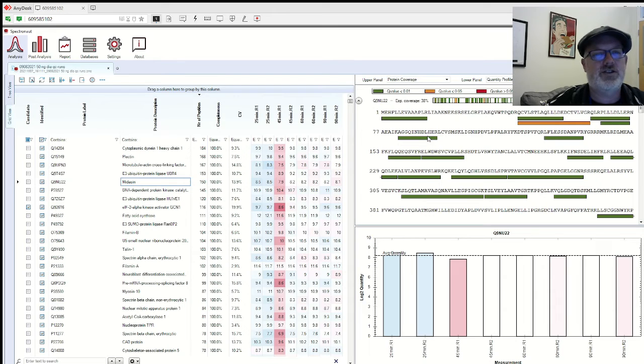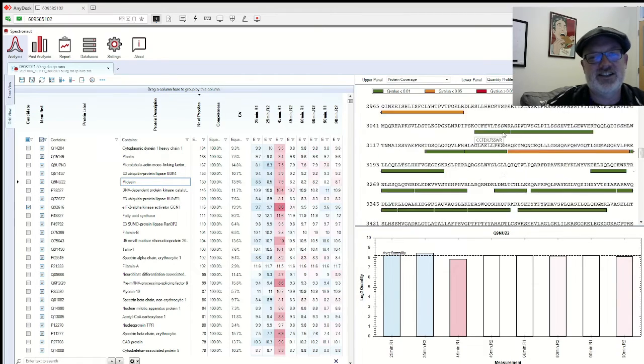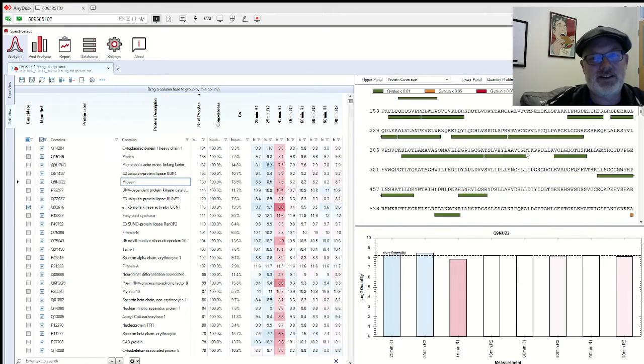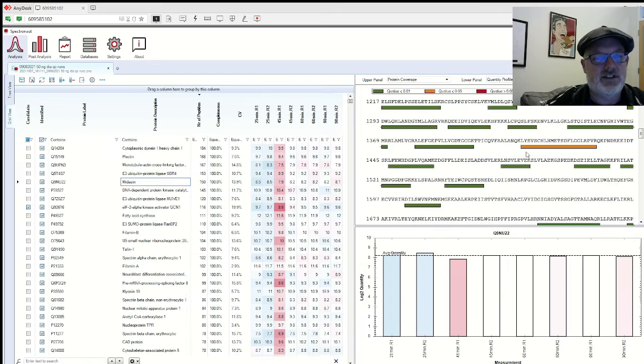What this means, I'll show you later. We could go over this for days, which we probably will. For now, let's think of the green as really good evidence. The yellow is maybe iffy, and the red is not good, but we're showing it anyway because it may still exist, there might just not be enough data to look at it.